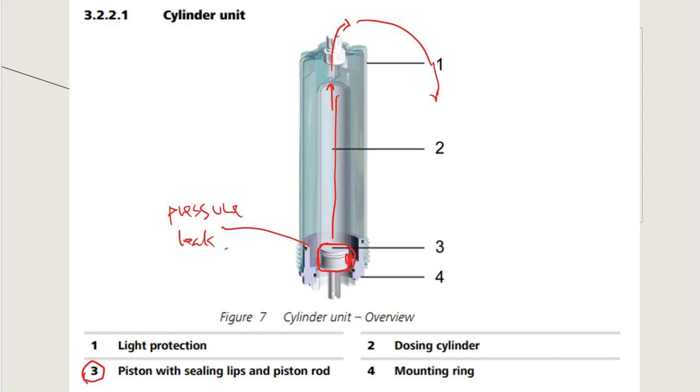It's something that you want to keep an eye on. Make sure that it's not damaged. Make sure it's not dragging. Make sure it's not leaking, because if that begins to happen, you are not really delivering the titrant that you think that you're delivering inside of the sample. And that's very important, because that's how your calculations are going to be based off of. So keep an eye on it. Make sure it doesn't get dry rotted. Make sure it doesn't damage over the course of time. These things last pretty long. They're meant to last long, but that is something that can happen with the burette area as you begin to titrate over the course of maybe months and months or years and years.